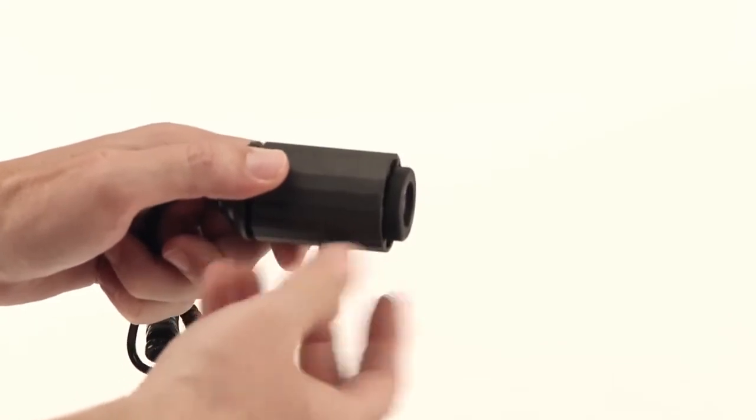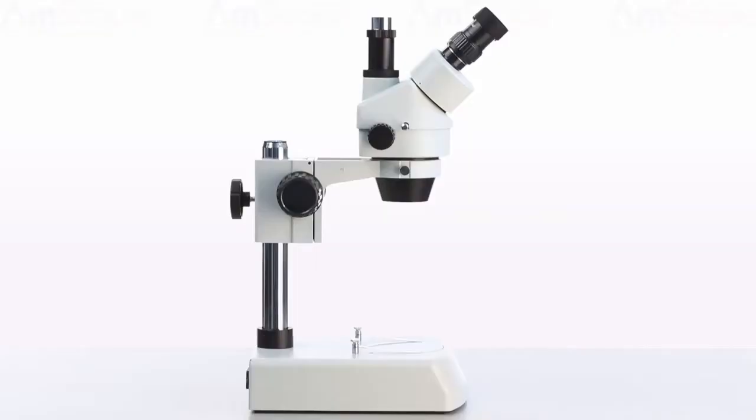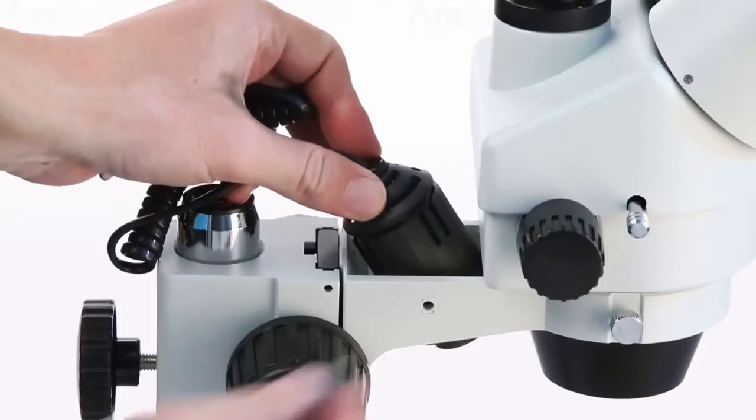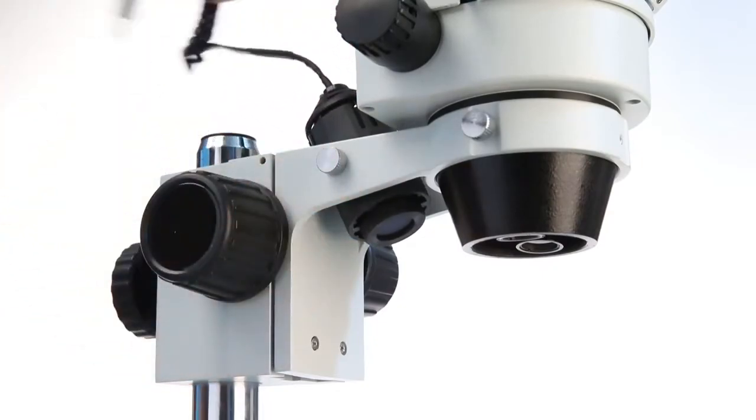Now we'll install the upper lighting module. Start by removing the locking screw. Insert the lighting module in the space behind the collar. Secure it with the light's locking screw. Then plug the power cord into the column's receptacle.